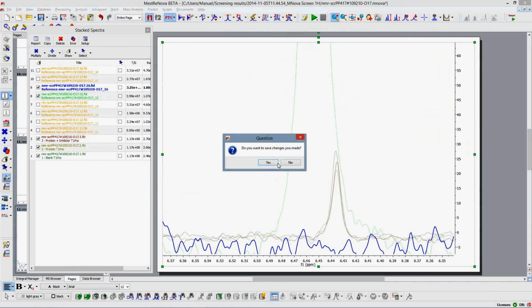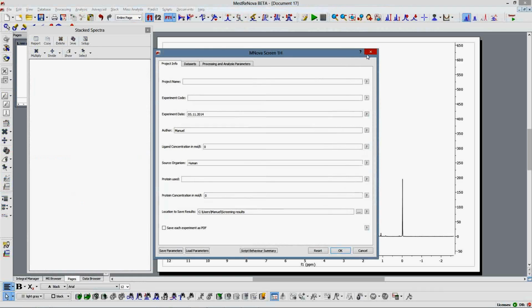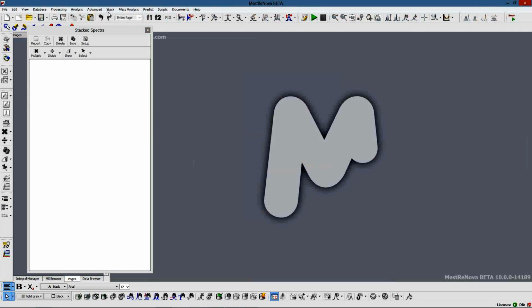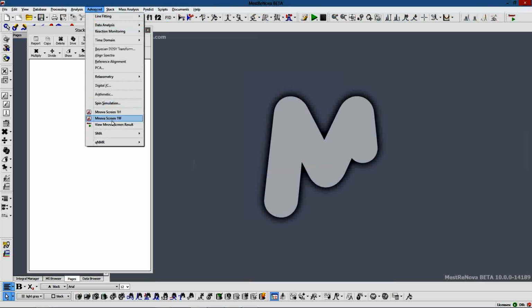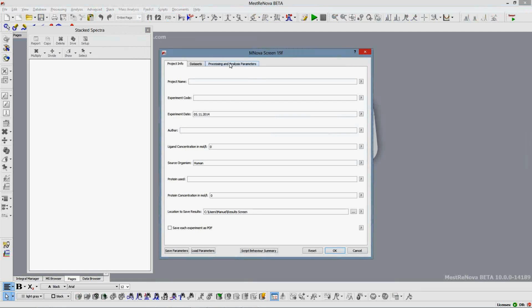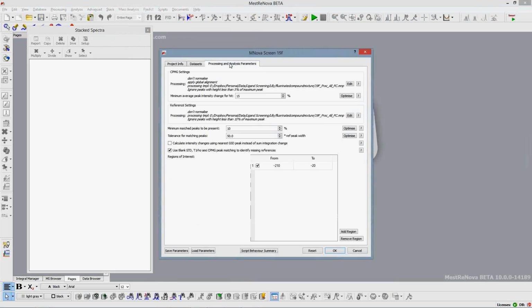As far as Fluorine is concerned, we are effectively talking the same. There is only one thing before opening for Q&A that I would like to mention for Fluorine. It was mentioned before, but I would like to stress it.